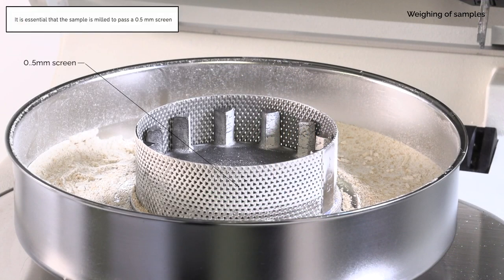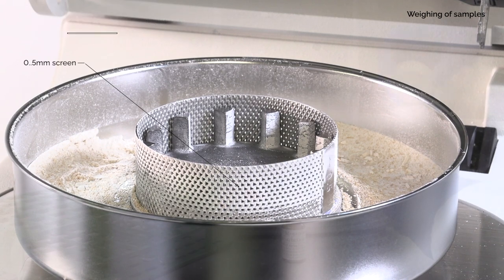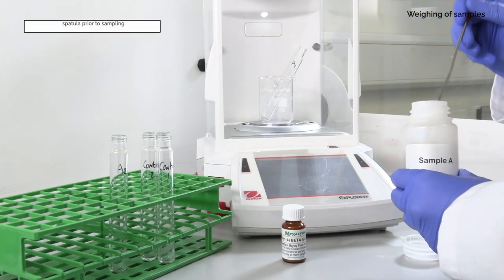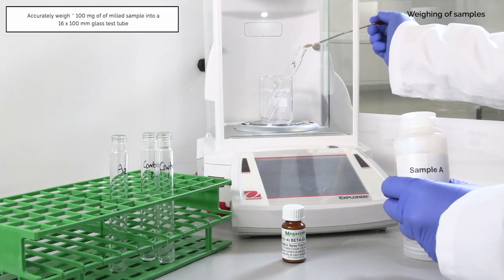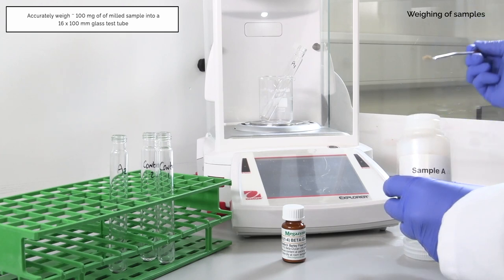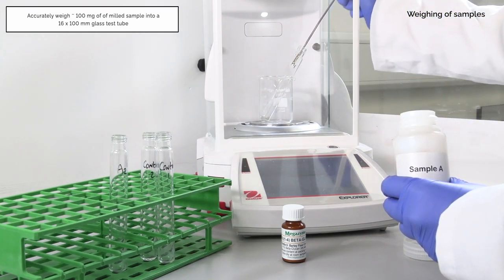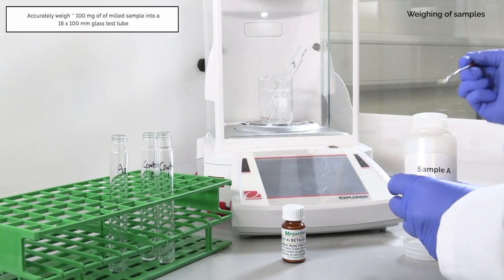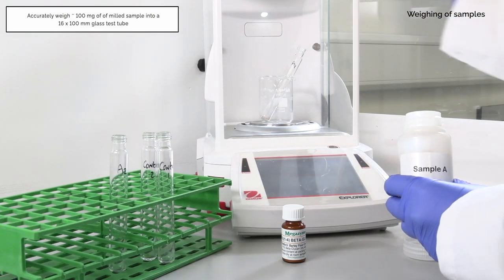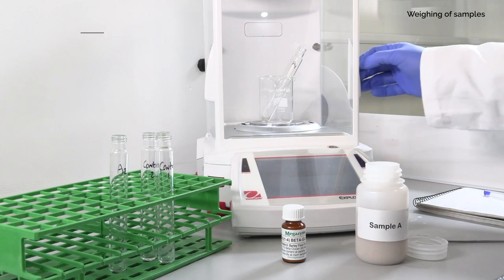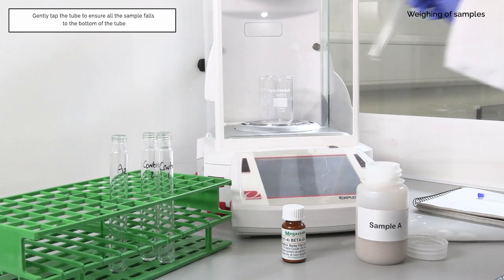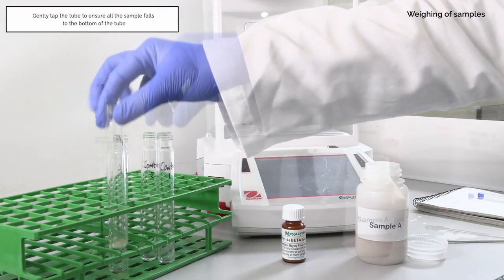In the beta-glucan analytical procedure, it is essential that the sample is milled to pass a 0.5 millimeter screen. Ensure the sample is mixed thoroughly by stirring with the spatula prior to sampling. Accurately weigh approximately 100 mg of milled sample into a 16 by 100 millimeter glass test tube and record the exact weight. Tap the tube to ensure that all of the sample falls to the bottom of the tube.